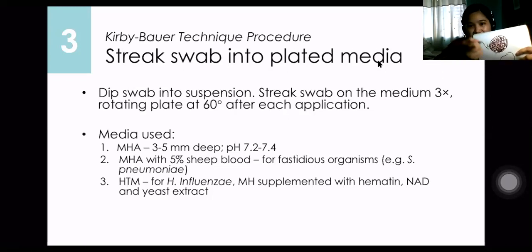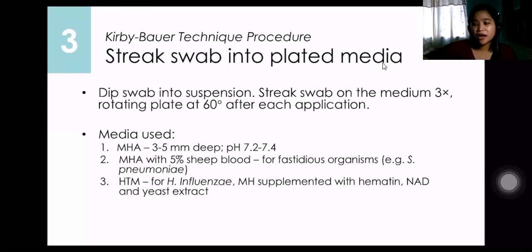So this test or this procedure is one of the most enjoyable things na ginahimo sa bacteriology lab. However, as we have learned, agar is daw gelatin na siya. So, samtang nag-streak ka, dapat be careful when you streak because may ginatawag kita nga arado.